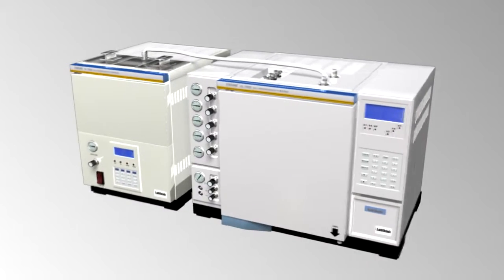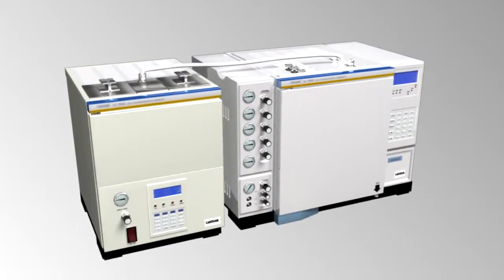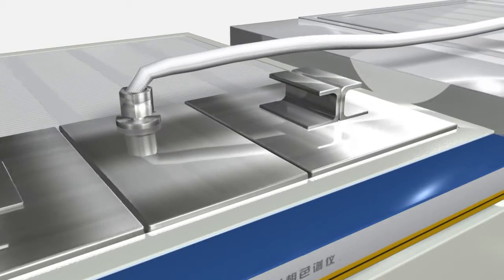The system consists of an auto sampler and a GC7800 gas chromatograph. The auto sampler has two large volume thermostatic chambers.